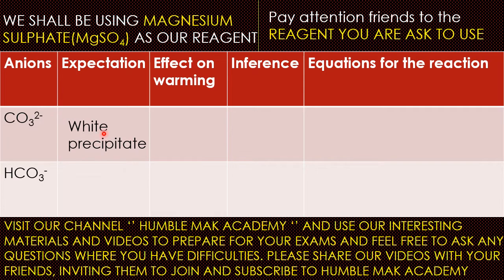Good. So guys, we want to see a white precipitate. On that inference booklet, you're going to copy out everything on your question paper. Then they might ask you further tests to determine the presence of either one of them, because two of them cannot be there, unless you're talking about the complex, and we should have a transition metal.